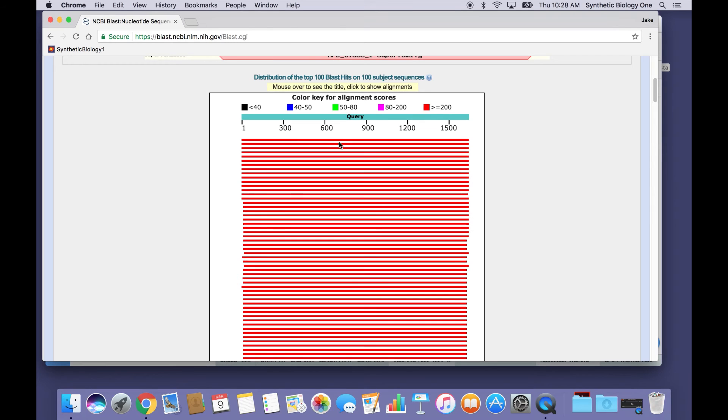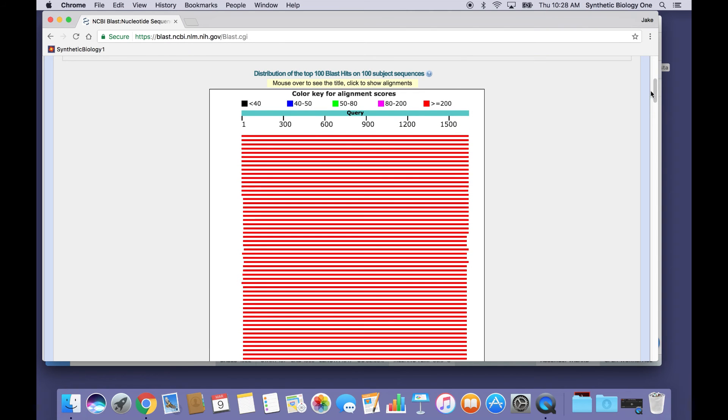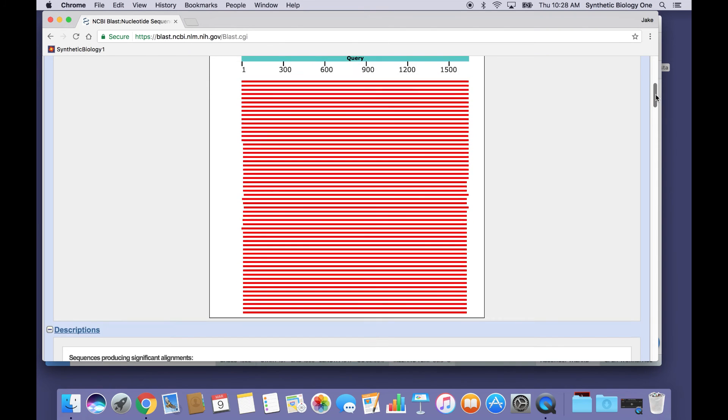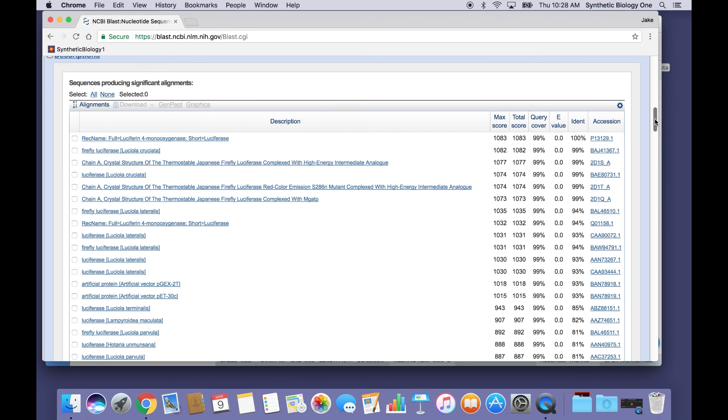So they're near perfect alignments or perfect. And they appear to be matching the sequence that I blasted across its entire length from about 1 to about 1600 base pairs. So this is a very good sign. It means that we found exact matches for our sequence.